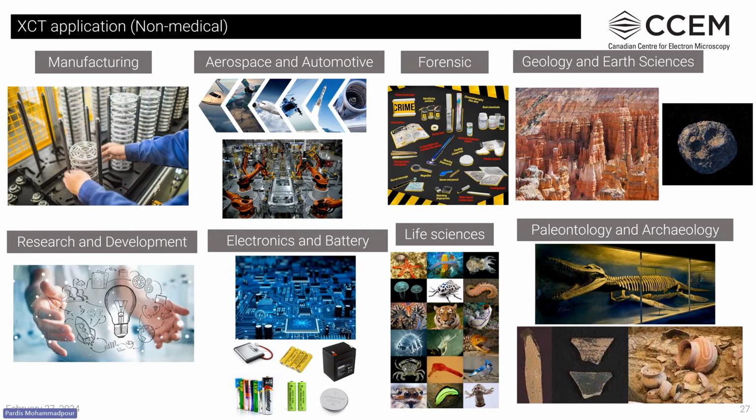With all being said about the XCT, it has application across various industries and materials. Here are some of the key sectors and materials where XCT is commonly used. In manufacturing, aerospace, and automotive industry for quality control and to inspect and verify the integrity of the critical components.